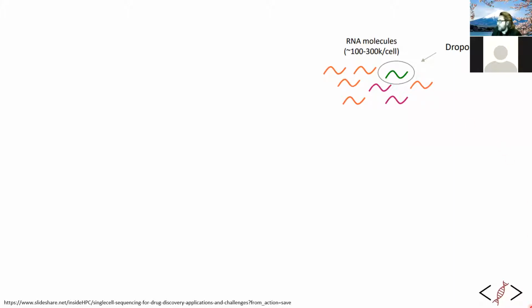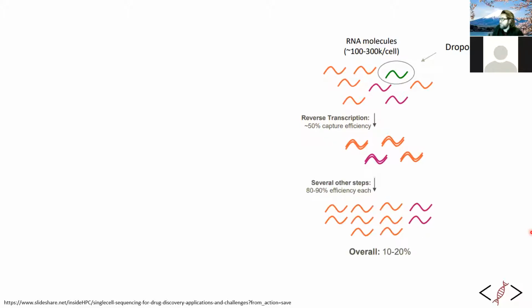Well, that essentially means that perhaps when you did your reverse transcription, when you did all the wet lab prep steps we talked about earlier, there was some gene or some transcript that for one reason or another did not get captured on the bead, and therefore it never got reverse transcribed, and therefore it never got amplified. And so then when you sequence it, even though this gene and this RNA was being expressed, it is not going to be present in your final data set. It's going to be 0.